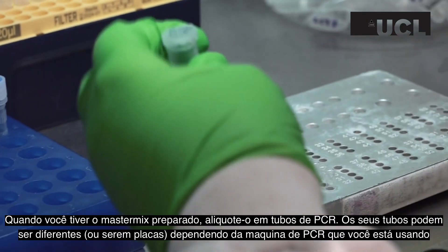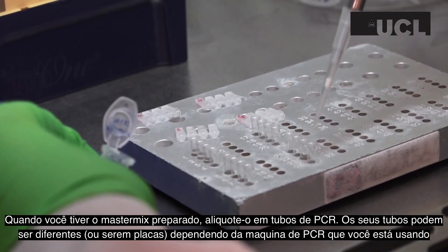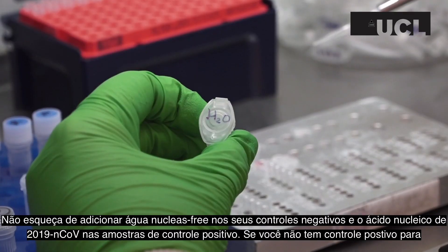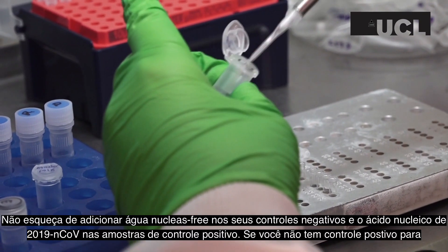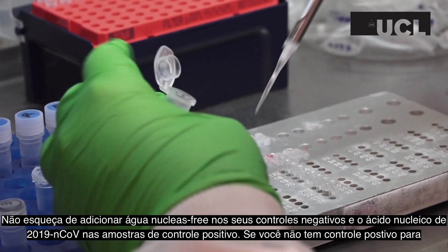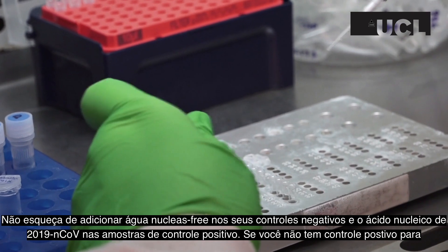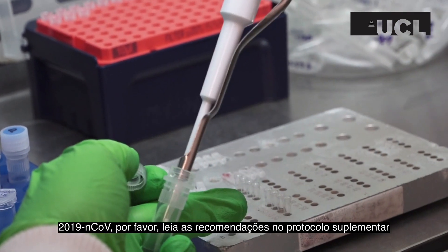Once you have created your master mix, aliquot it into the PCR tubes. These may differ or be plates with wells depending on the PCR machine you are using. Don't forget to add nuclease-free water to your negative controls and 2019 nCoV nucleic acid to your positive control tubes. If you do not have 2019 nCoV RNA for your positive control, refer to the supplementary protocol PDF.